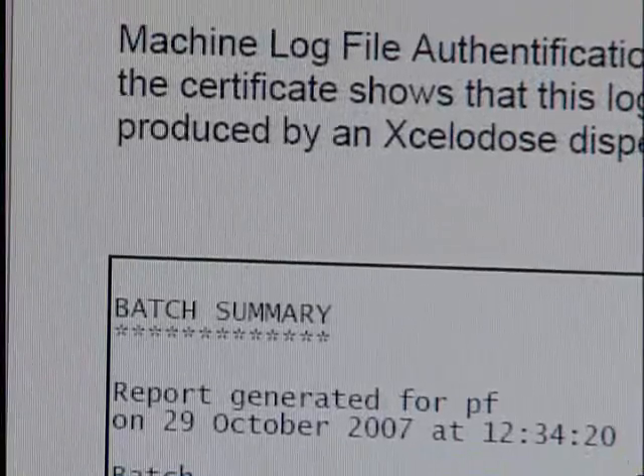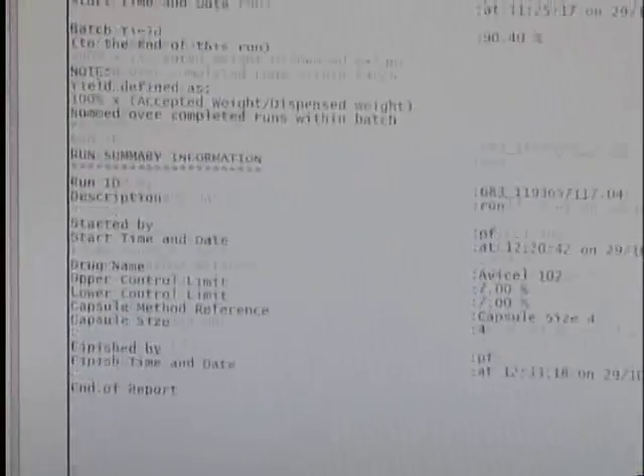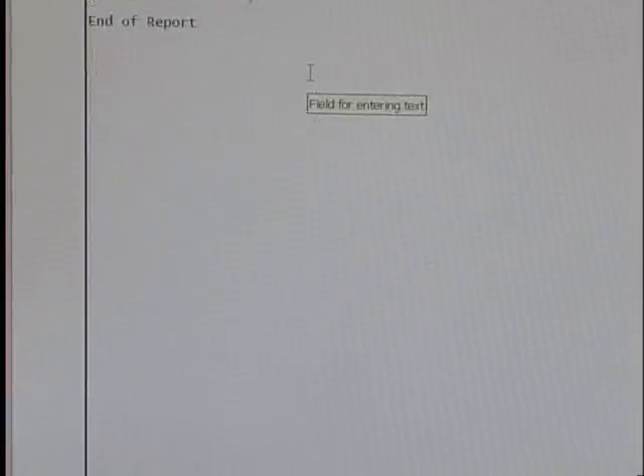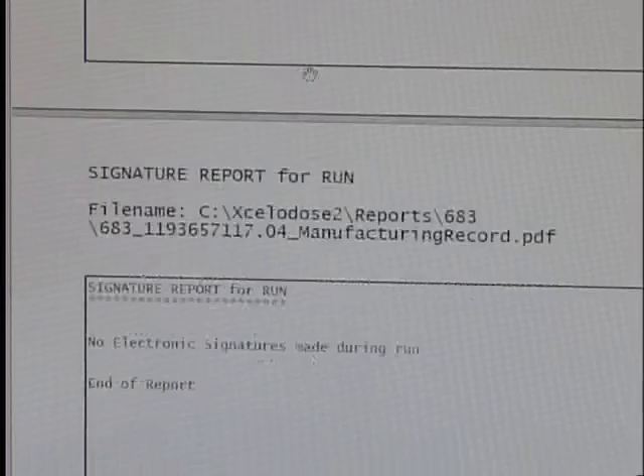A 21 CFR 11 electronic batch record featuring individual records for each capsule filled is created, which may be used with a compliant database to meet FDA requirements.